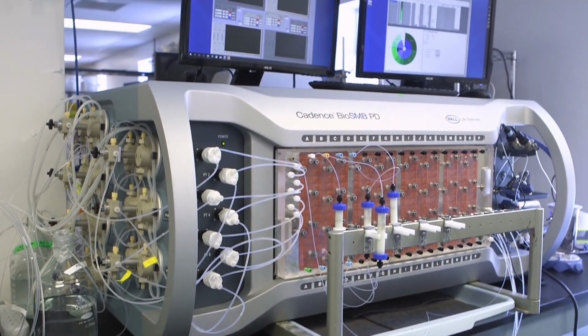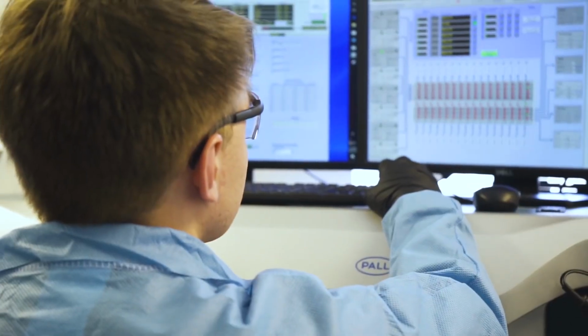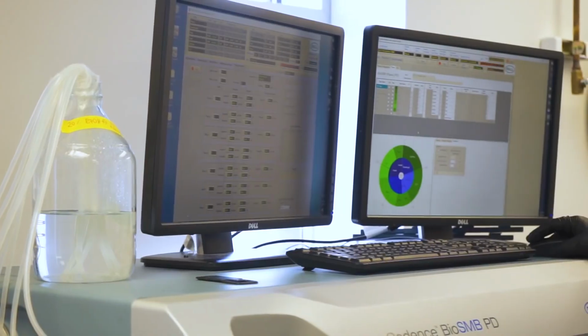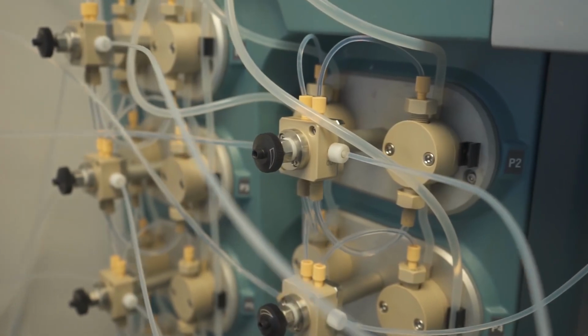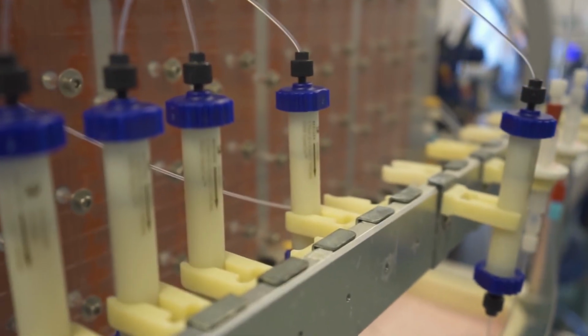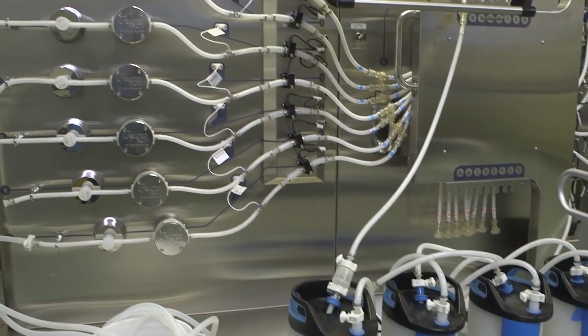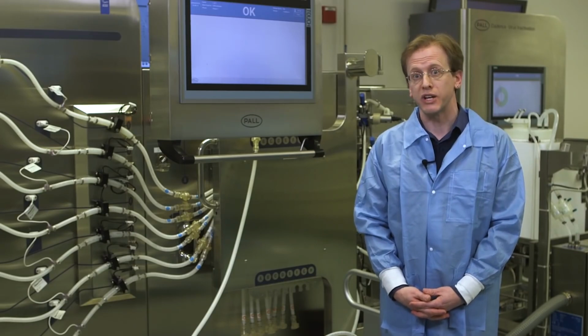Multi-column chromatography enables us to replace the large columns that are used in batch operation, cycling much smaller columns through the chromatography steps, thus enabling us to process the same harvest volume using much smaller volumes of sorbent. One of the big drivers associated with continuous operation is obviously the reduction in the amount of sorbent that's required to process a given volume. By enabling us to reduce the size of our columns and the footprint of our systems, we can enable the use of single-use systems, as well as improve the safety of the manufacturing facility.